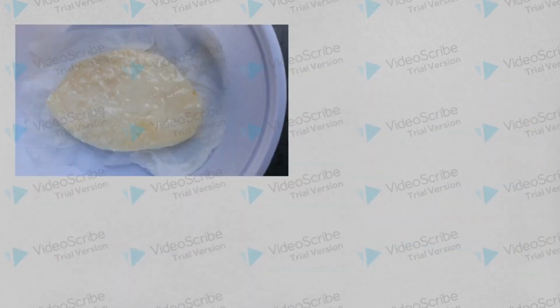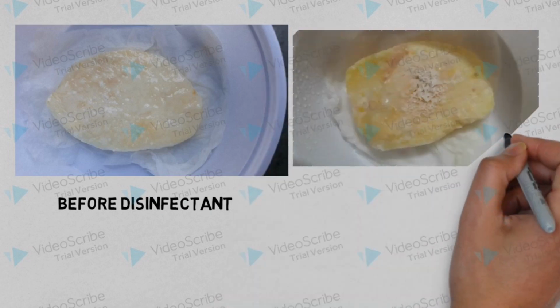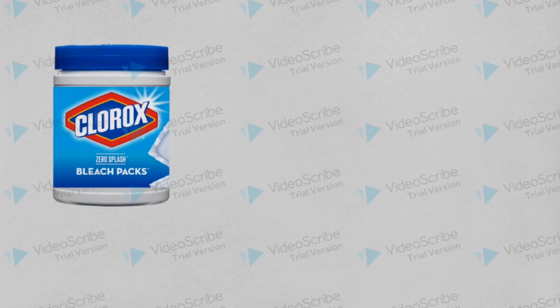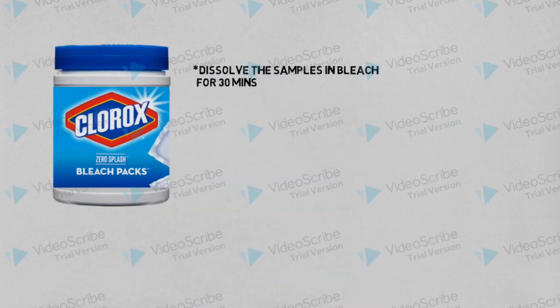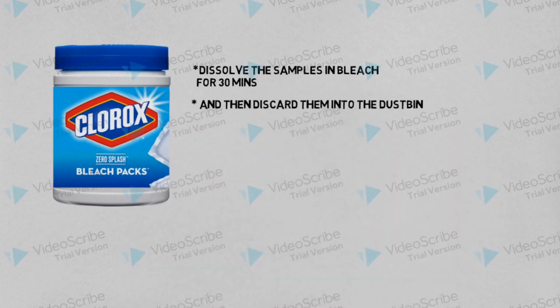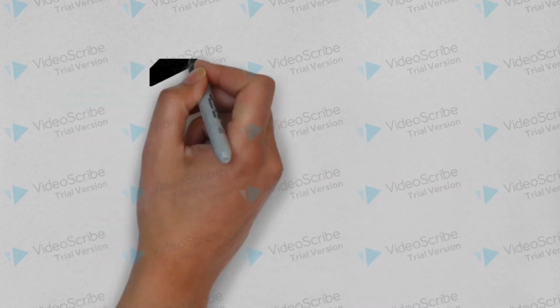And lastly, we can see the effect of disinfectants on bacteria, as we can easily make out that there are fewer bacteria grown on the disinfected samples than the normal samples. After these experiments are conducted and observations are noted down, we have to discard these samples by dissolving them in bleach for 30 minutes and then disposing of them. We do this by following our biosafety norms so that no infection is spread.